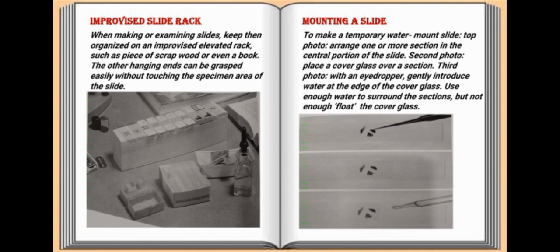Okay, an improvised slide rack is a makeshift holder or organizer used for holding microscope slides, typically in a laboratory or educational setting. It is useful when a proper slide rack is not available or when you need a temporary solution for organizing slides.